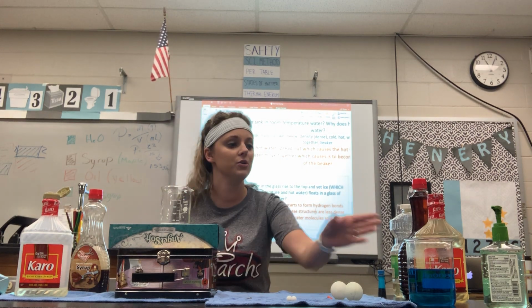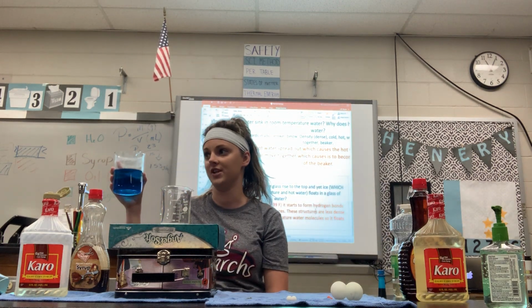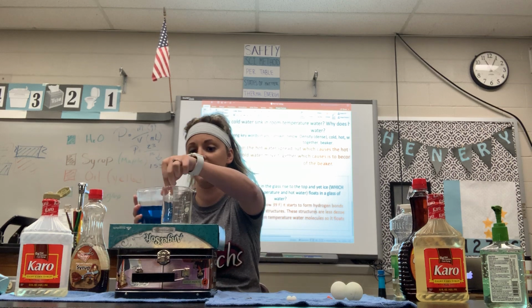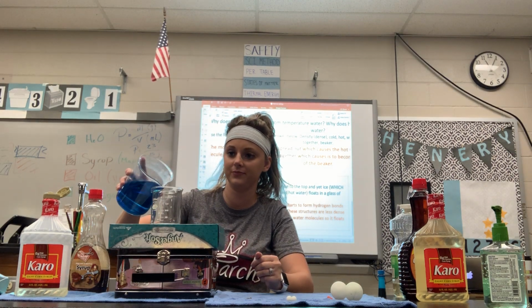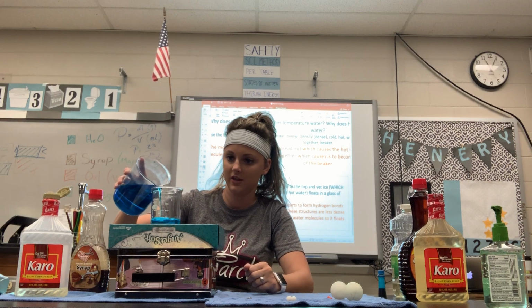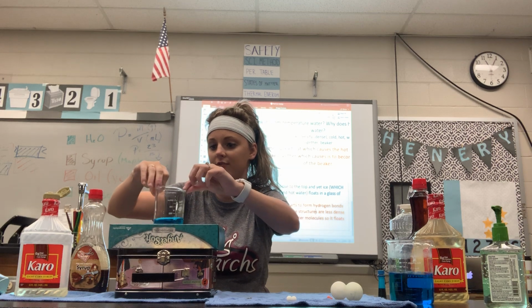So what I'm going to do is I have blue food coloring that I've put just in regular tap water. I am going to fill it to about 50 milliliters. And then I'm going to turn it because I want you guys to be able to see the full view. So okay, 50 milliliters of blue water.